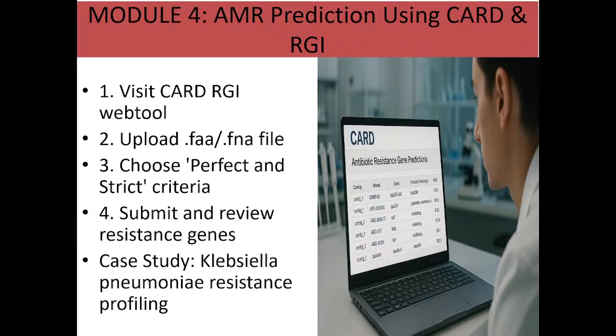You culture, you identify, you do whatever you want to do with it, and after that you do the DNA extraction. After the DNA extraction, you run the polymerase chain reaction that amplifies the DNA that you have. After amplification, you do the sequencing, complete sequencing, to know the type of alphabet that the organism has. And not only the type of alphabet, you also know the arrangement of those alphabets, because the way the alphabet is ordered will go a long way to give us information about anything.